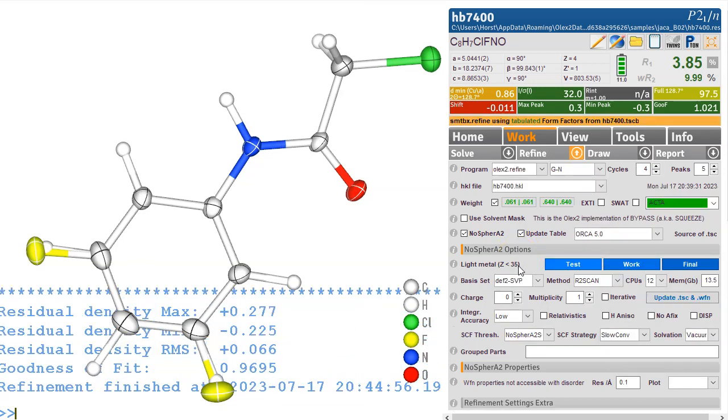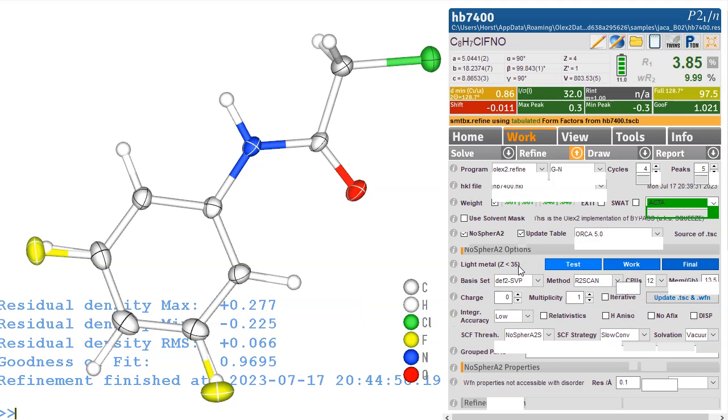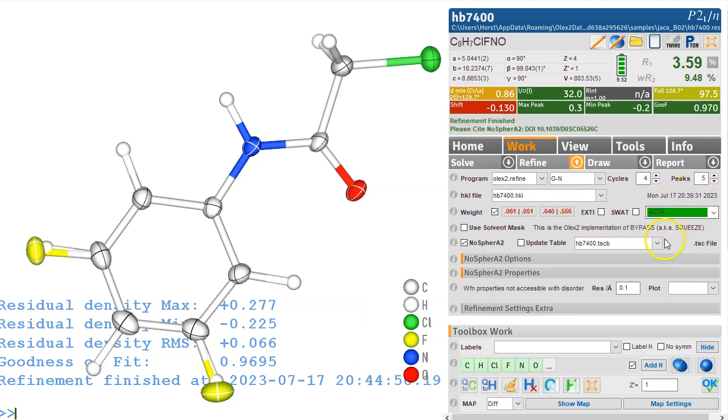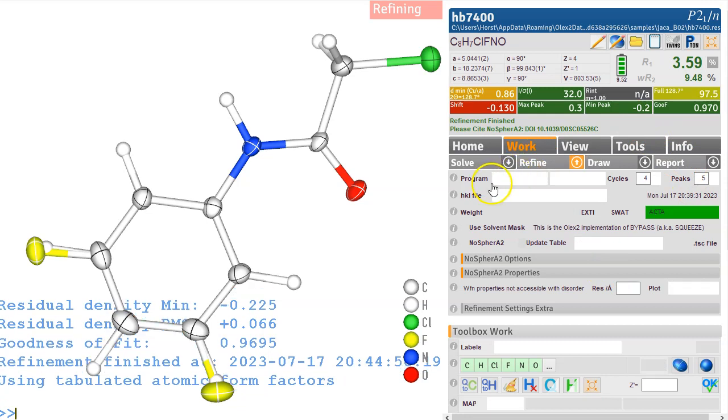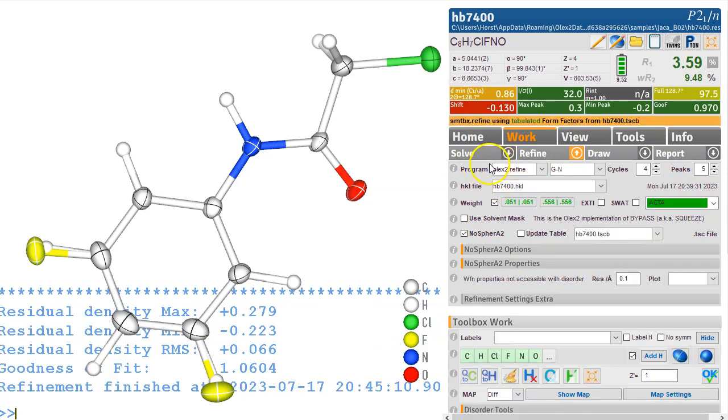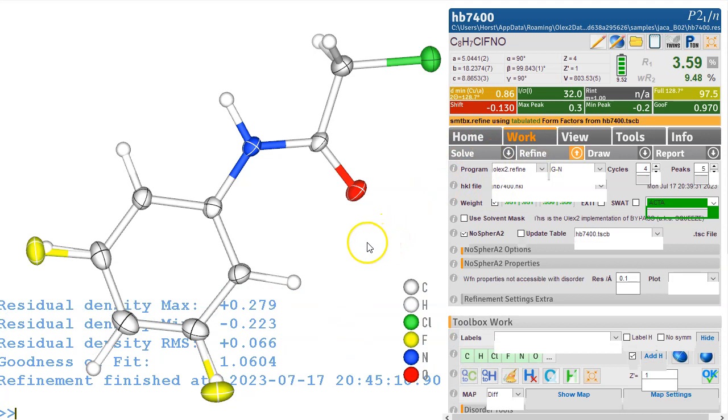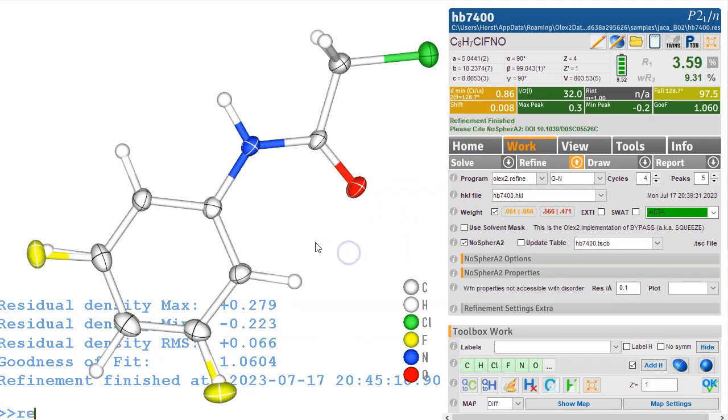When we're done we're not really finished because we chose the second level here, the work level. So this is when you're supposed to work with these non-spherical form factors. In order to finish this off properly, you'd really need to go into the next level, the final level, and then do everything until it's completely settled. So I'm not doing this now because this will take a little bit longer but we finish the refinement here, make sure that everything is settled with the current form factors, refine 12 so that should really deal with it and see whether we can see anything.